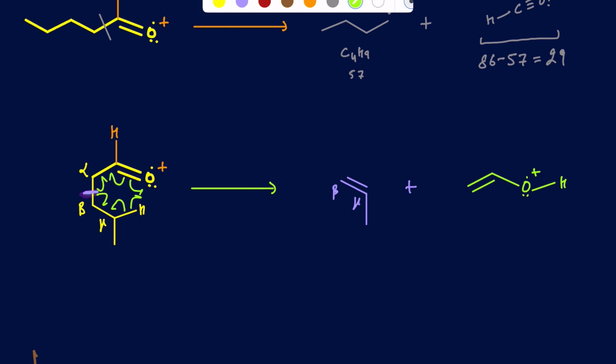Okay, so then this will not show up in the mass spec, so that's going to be C3H6. That's going to have a molar mass of 42. This will show up. That would be your McLafferty rearrangement there. And I can do the math here, or I can even count the number of carbons and everything. So that would be C, 1, 2, 4. So that would be your 2 carbons is 24 plus 4, that's 28 plus another oxygen, that's 16, so that's going to be about 44. So you should see it at 44.